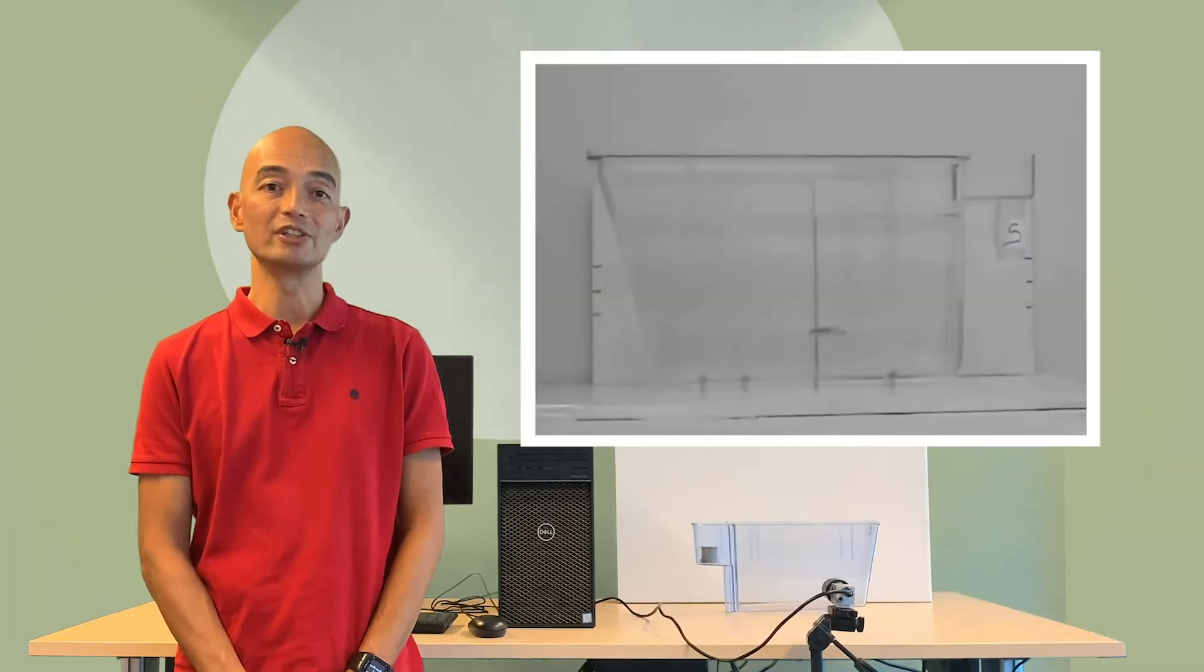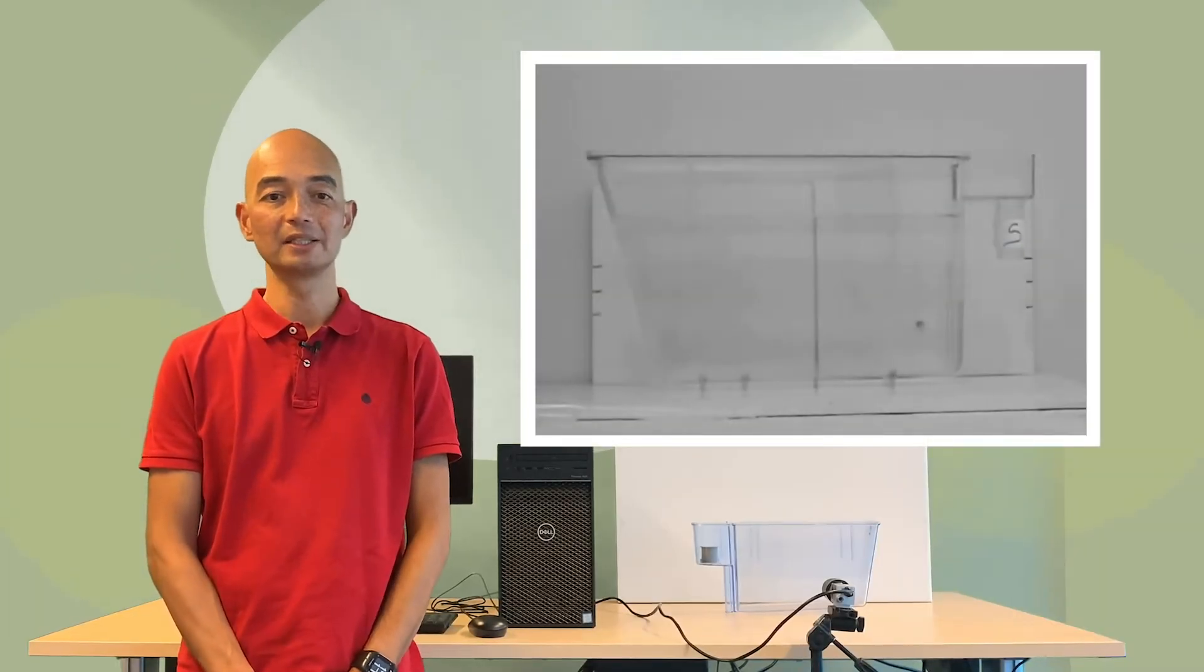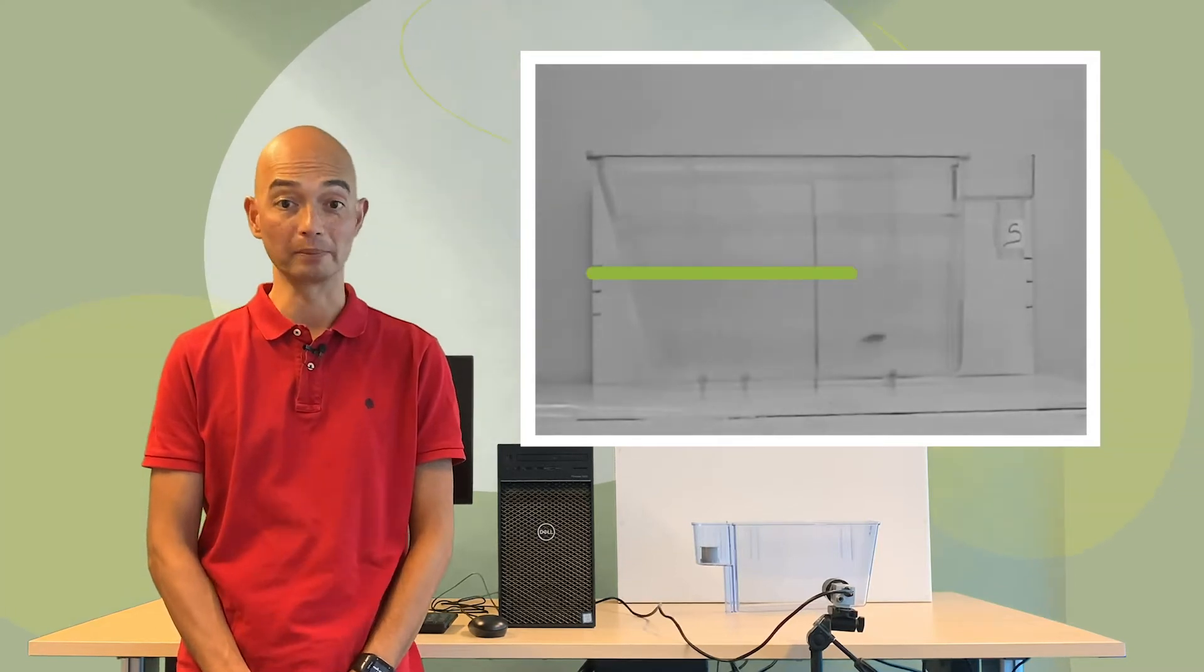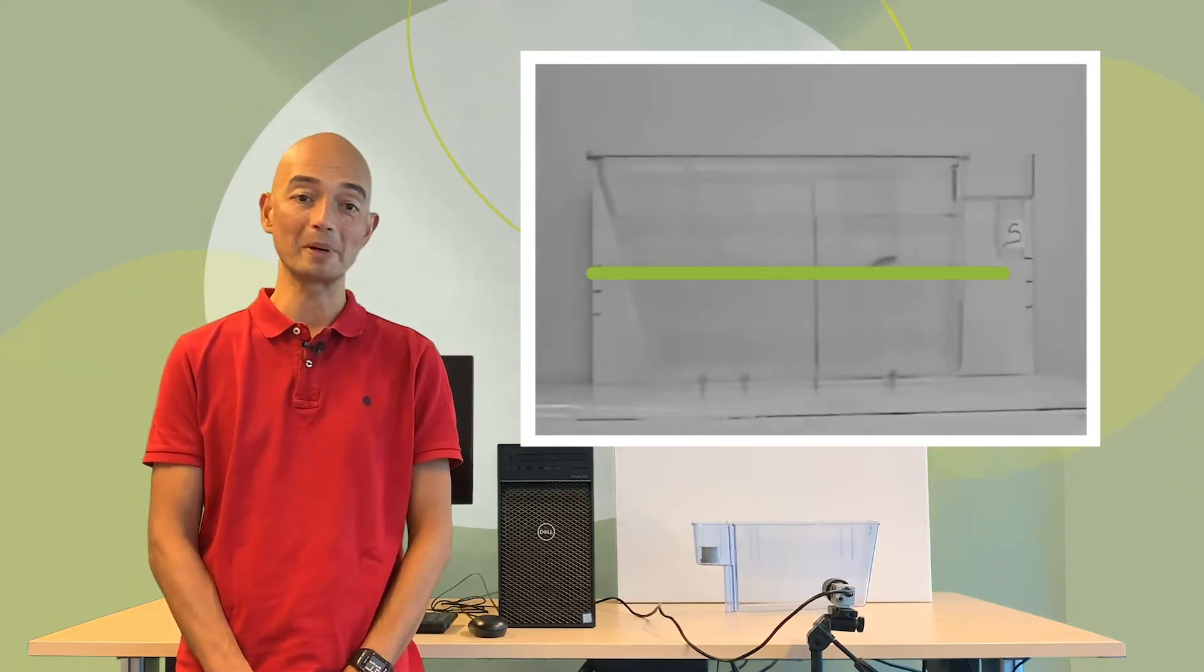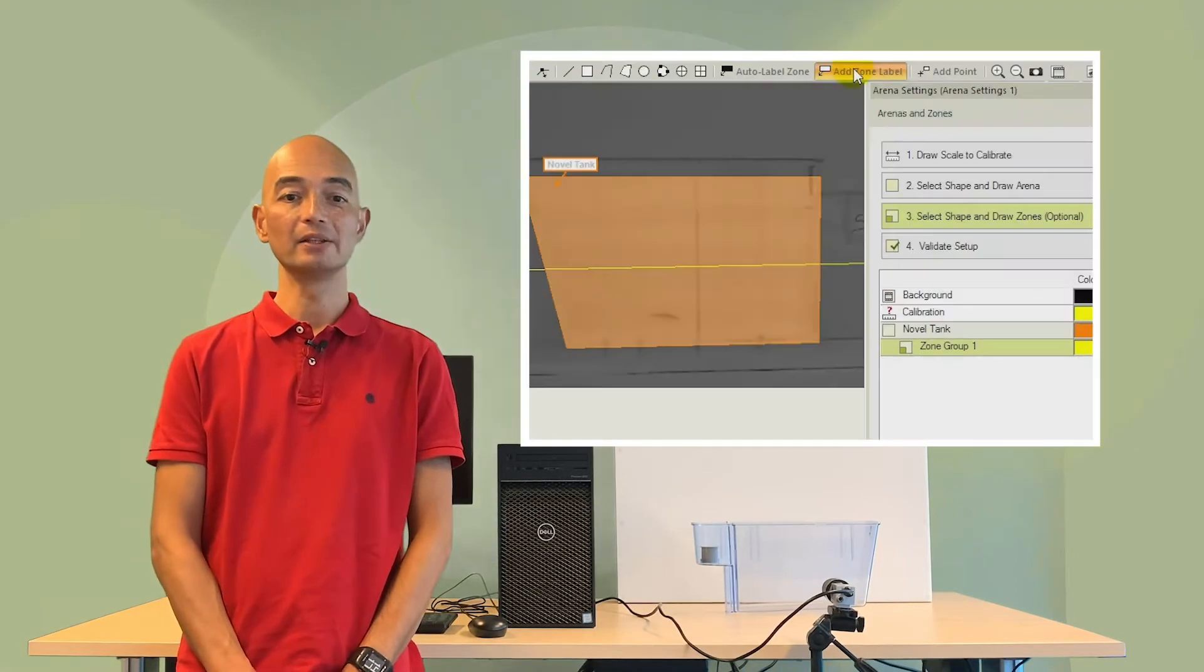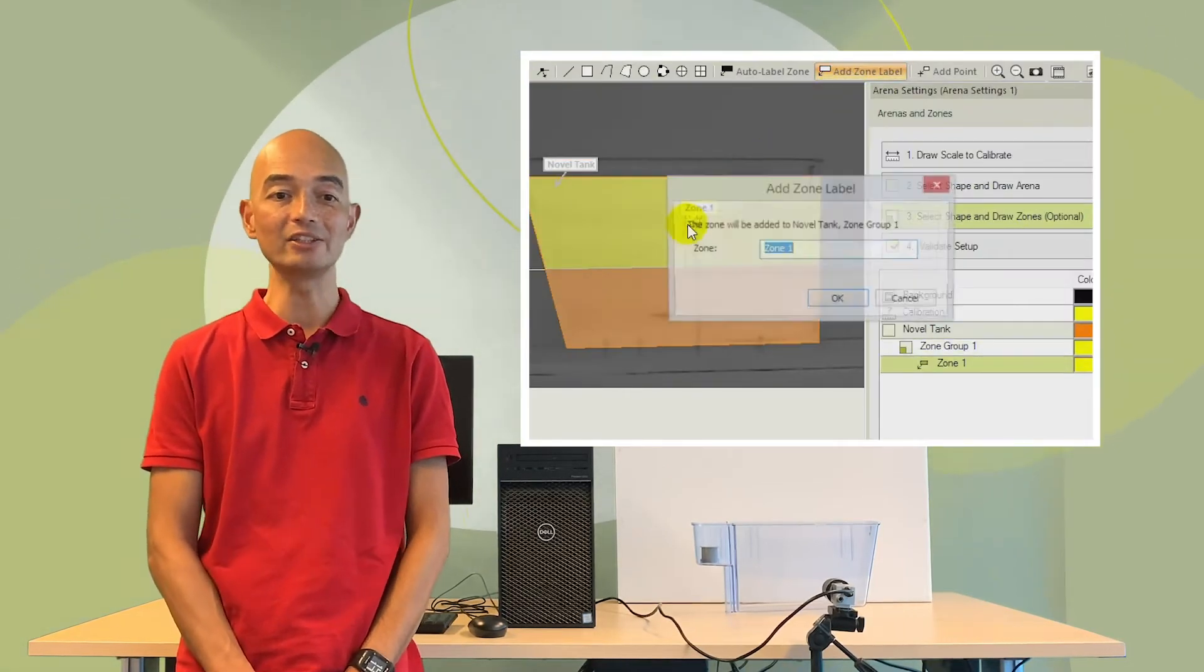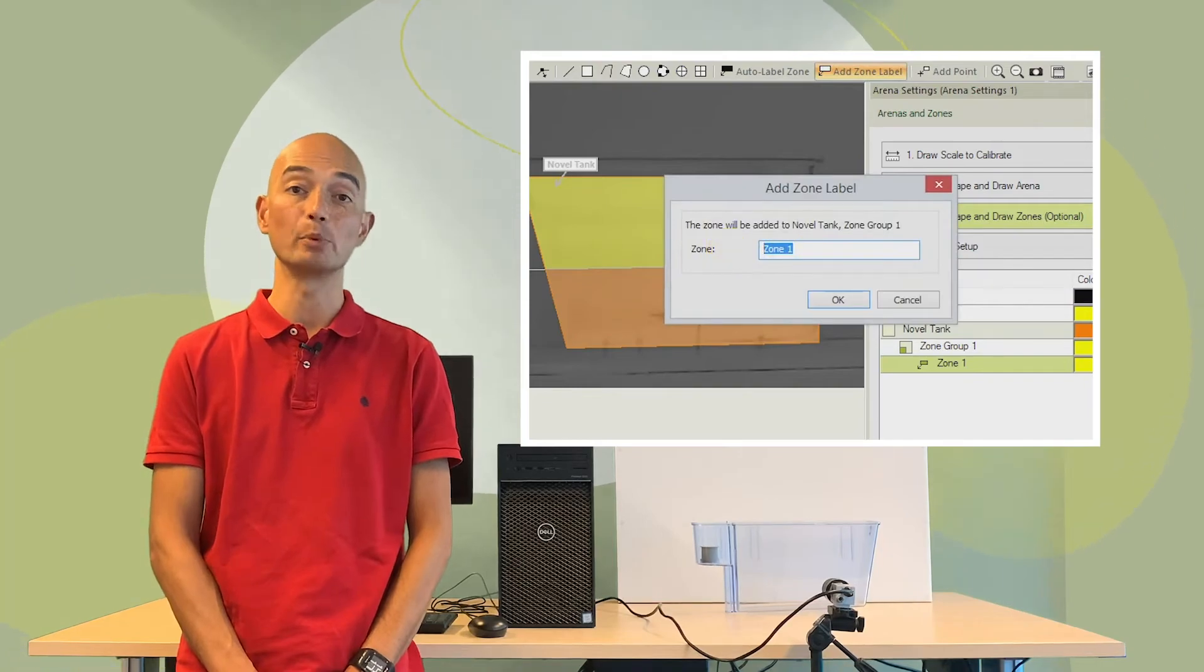As soon as a zebrafish is put in a tank, it will most likely dive to the bottom. When it starts exploring the top half, it shows less anxiety. Thus, the time spent in both halves and the latency to crossing to the top half are important parameters.